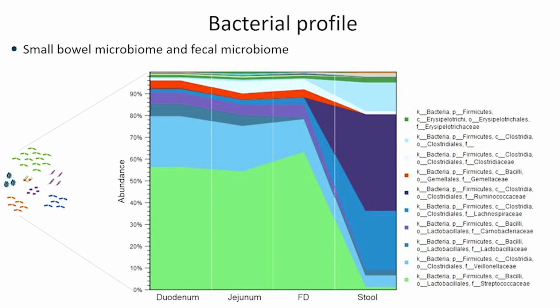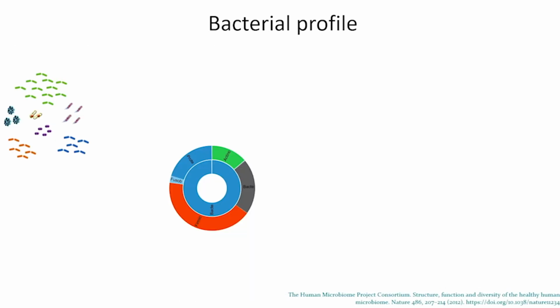The report sometimes comes to you as a pie chart, on the other hand. So let's understand these pie charts as well, because this is just a different way that we organize the microbiome data. So again, we separate those microbes based on who they are and how we can classify them, and we organize them in a pie chart, taking into consideration their taxonomic classification, right?